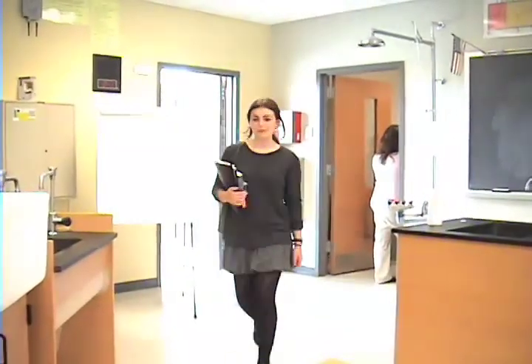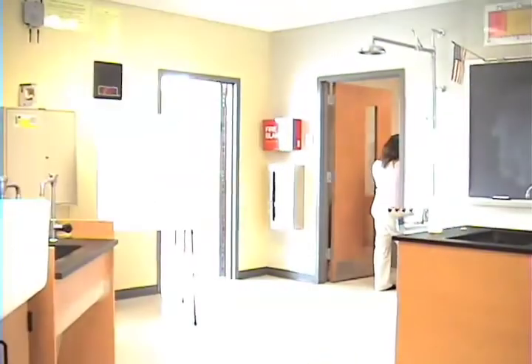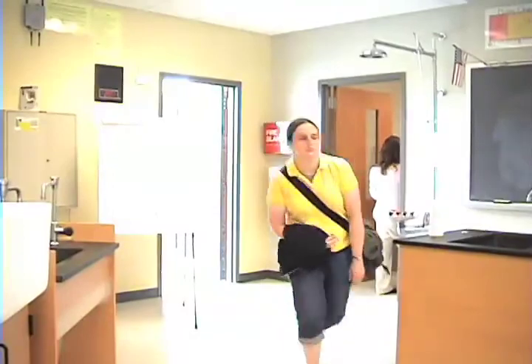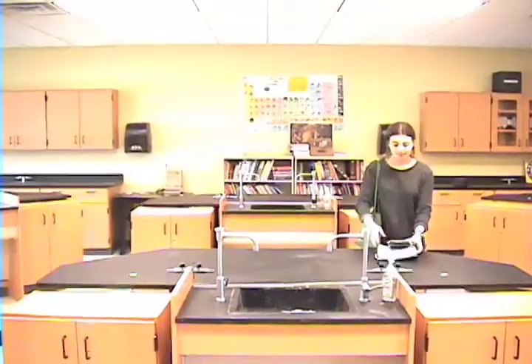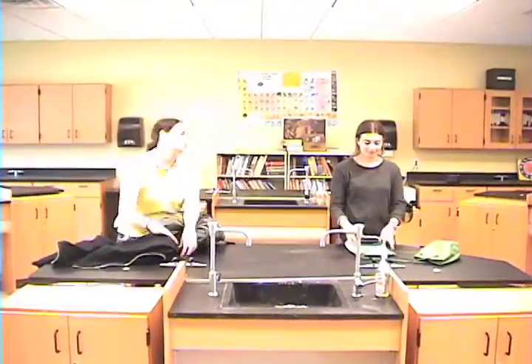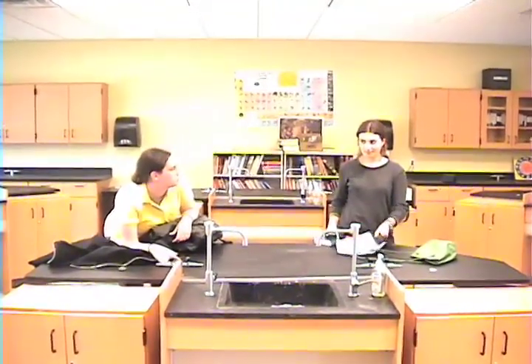A responsible kind of student and her irresponsible lab partner. Carefully set things aside and be prepared.